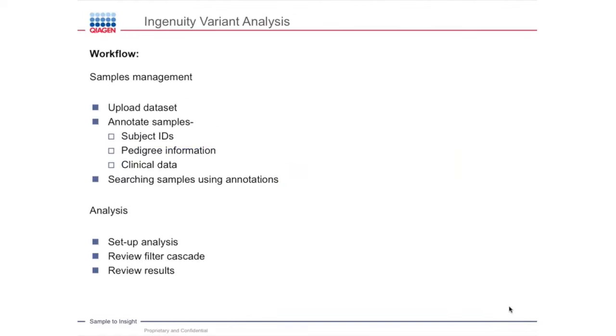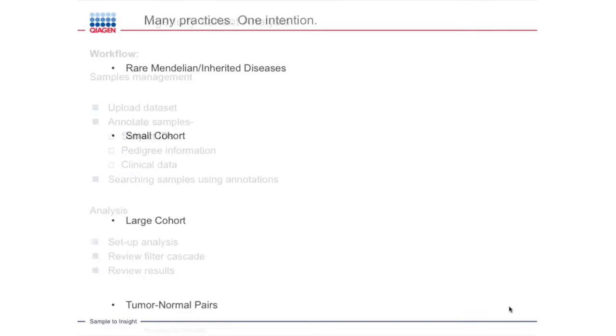So for the purposes of today's webinar, what we will do is talk about how you will manage your samples in the application to upload, annotate, and search samples. And then we'll look at setting up an analysis, take a little deeper dive into the filter cascade, and also review the results in the analysis, in the application.